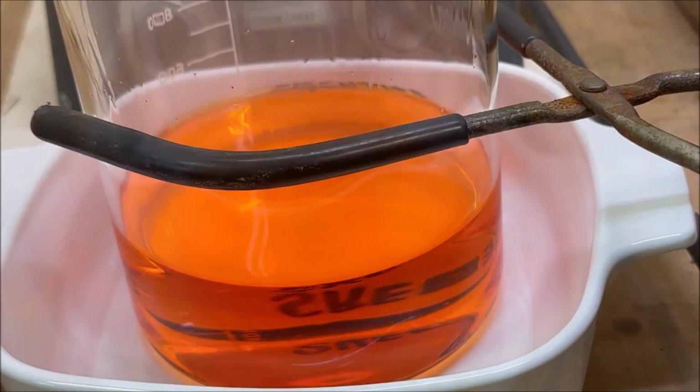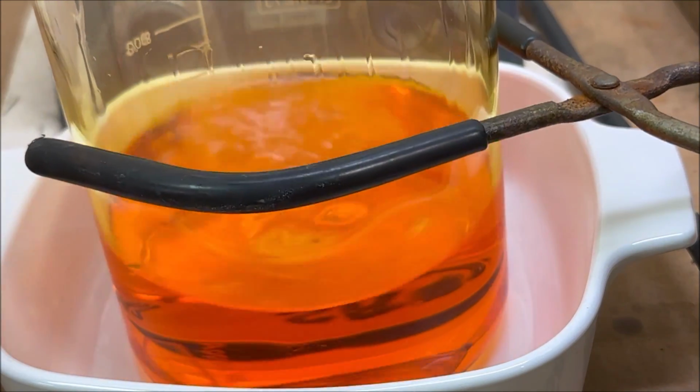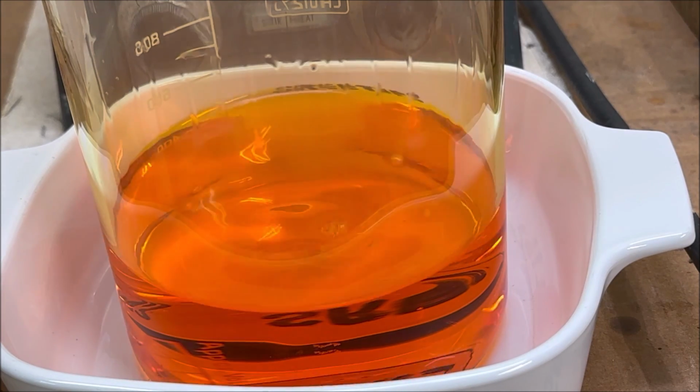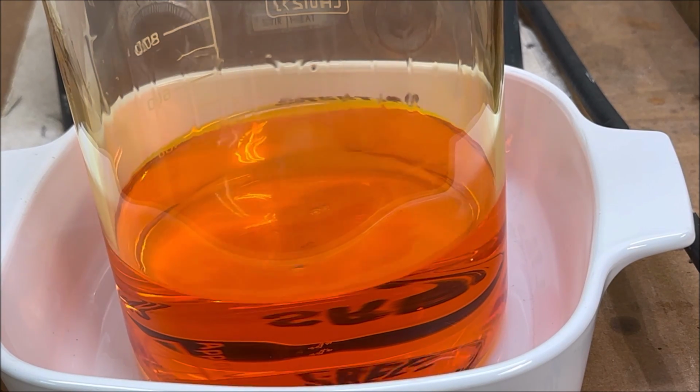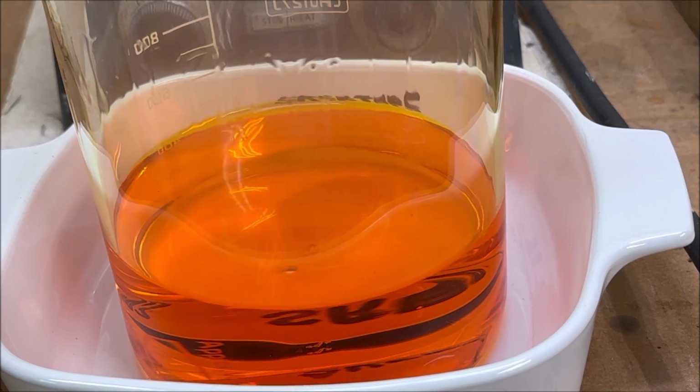I didn't see anything precipitate out when I added the sulfuric acid. I don't think there's any lead left in there. Doesn't hurt to put that in there anyway. You can see there's just a few tiny crumbs of gold left in there that did not dissolve. That's okay. We'll put that in the filter and add it to our paper storage.